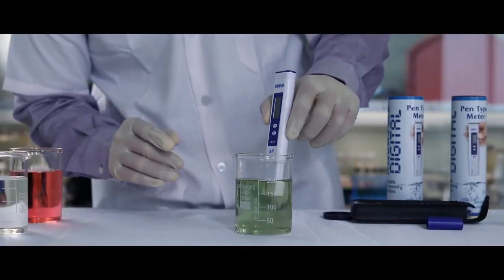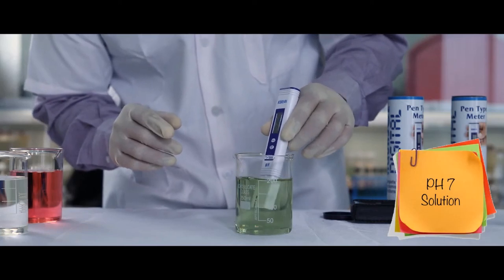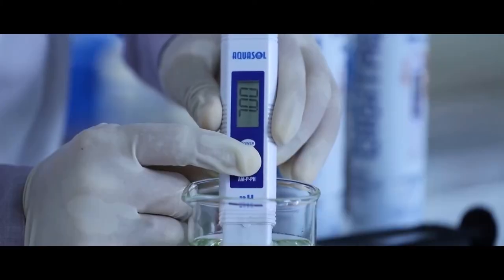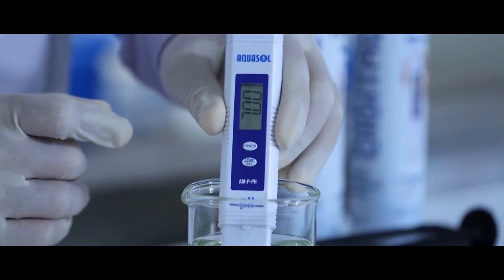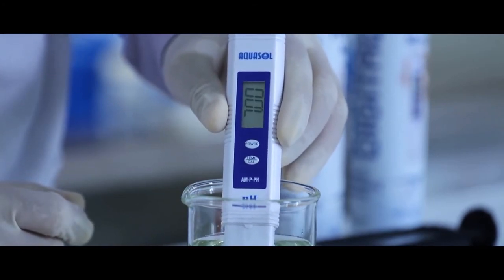To calibrate, dip the electrode in the pH 7 solution. Stir gently to a stable reading. Press and hold the cal key. Once the meter starts flashing, the meter is calibrated to pH 7.